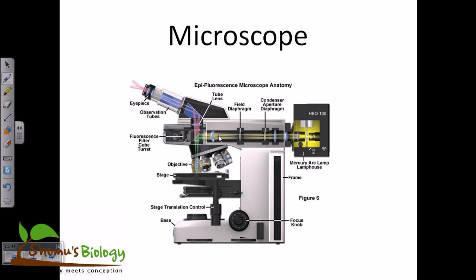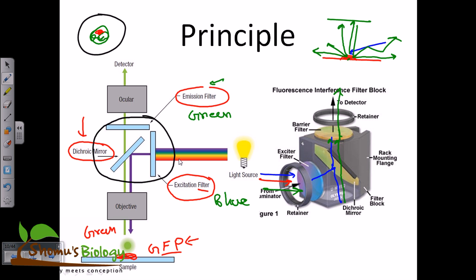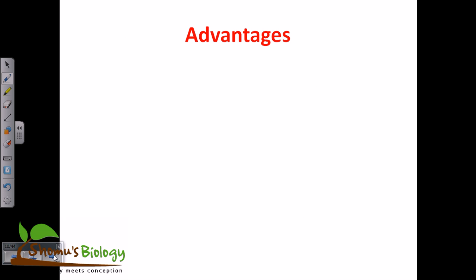The fluorescence microscope that we see has an extremely similar structure to the other light microscope or bright field microscope. As you can see here, the difference is only the presence of certain other types of lens, but actually the filter that is present is the most important part here. This is the actual construction. The three things, the excitation filter, the dichroic mirror, and the emission filter, the complex of these three things are the most important fact about all of this fluorescence microscopy actually.